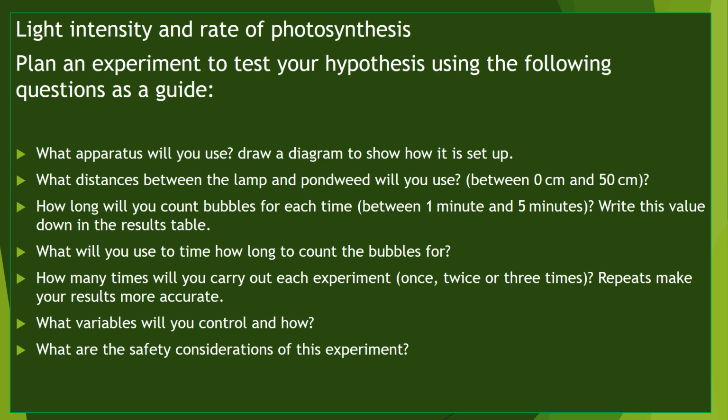So lastly, what are the safety considerations of this experiment? Now, we're obviously using electricity. We've got a lot of water and we've got a lot of glassware. Think about your risks and how you could control them. It's really important that we work safely.